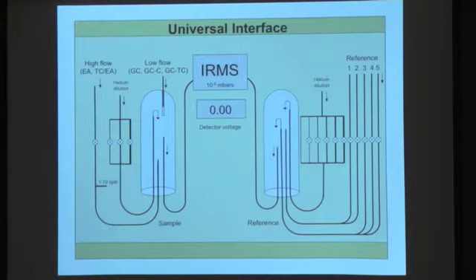The point you want to learn about this instrument is that it has a hollow glass tube. The end of this tube is at a very low vacuum. It sits there and it sniffs the whole time. As the gas passes by, it sniffs it, and that's how it gets its sample. This is open to the atmosphere, not under vacuum, while this is under very strong vacuum. These things actually move around.